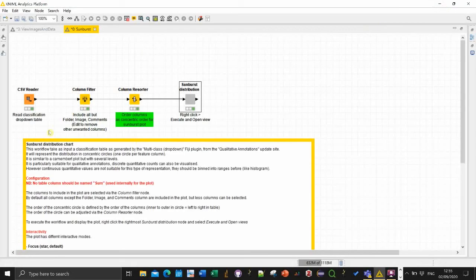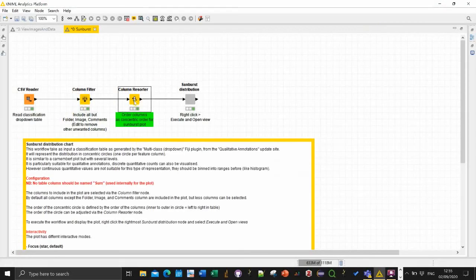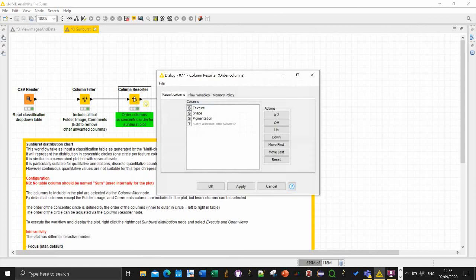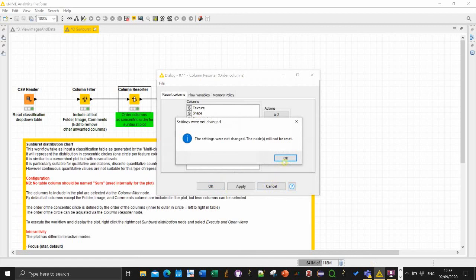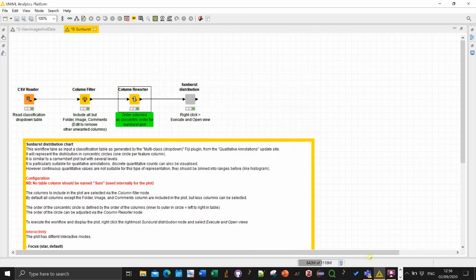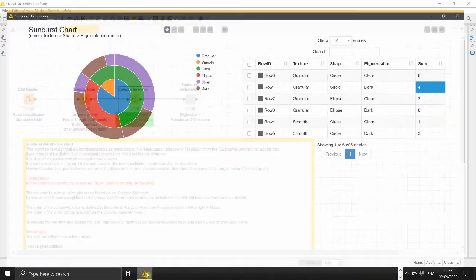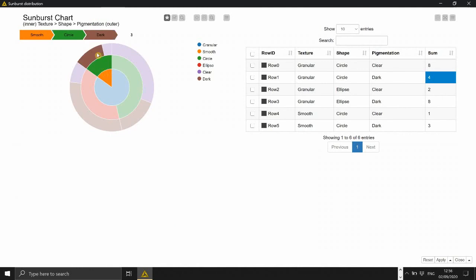You decide them by ordering the column which is just here column resorter. So as you can see I choose to have texture, shape, pigmentation and by doing so you would see that indeed texture is the first one then shape and pigmentation.